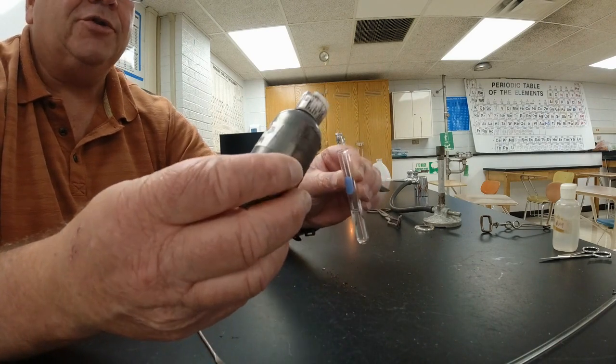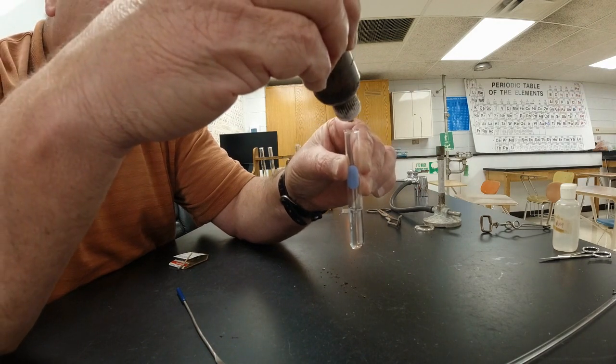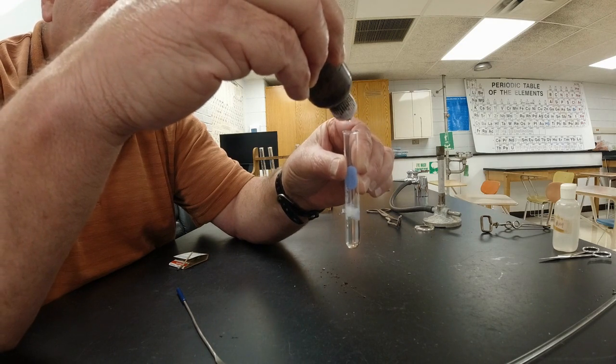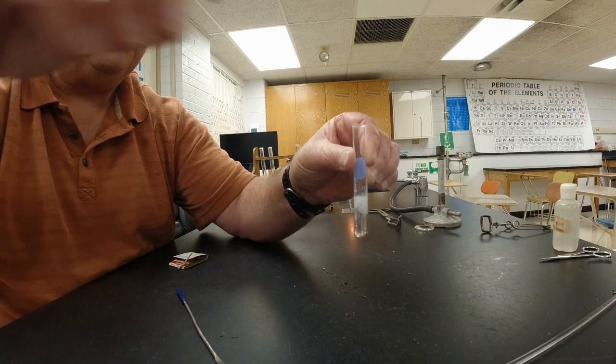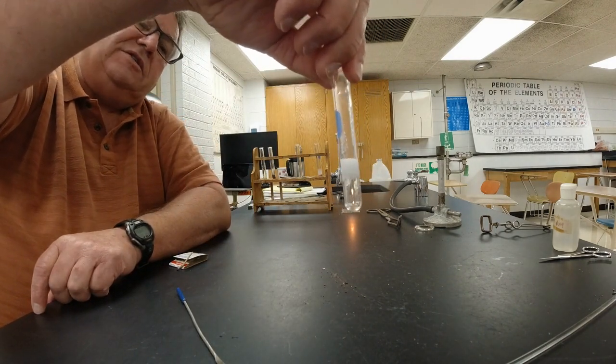You definitely would not drink this. All right, so watch carefully while I add. I'm just going to put 1 or 2 drops of silver nitrate in there, and I hope you guys can see that. There's 3 drops, and immediately you can see there's a reaction. It looks like a white, looks like it's separated in here.